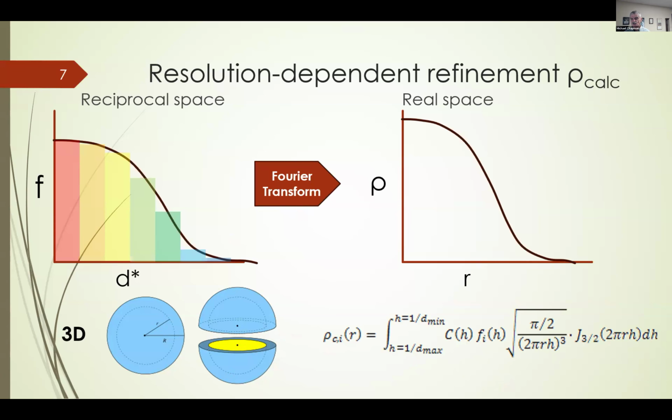Another couple of things that I'd like to note. We're assuming that the scattering falls off with spherical symmetry. We haven't yet incorporated anything for anisotropic thermal motion. Now, from the closed form integral that we've got here, what we are essentially doing is taking a shell for each shell in reciprocal space through this formula here, calculating its Fourier transform, and then adding the components to get this scattering, to get this density function, atomic density function in real space.